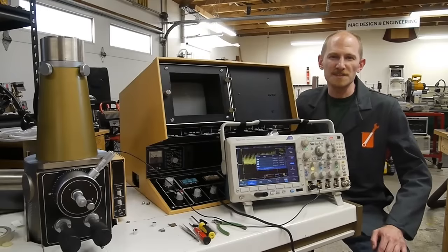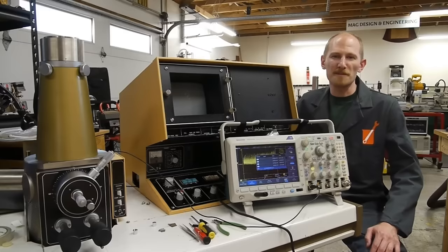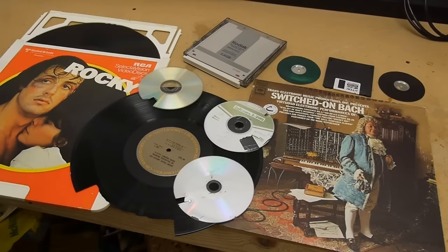Ever since setting up this electron microscope in my shop, I've wanted to make animations with it showing video taken through the microscope. I've also been thinking about different recording media lately, so I put the two together this weekend and came up with this.